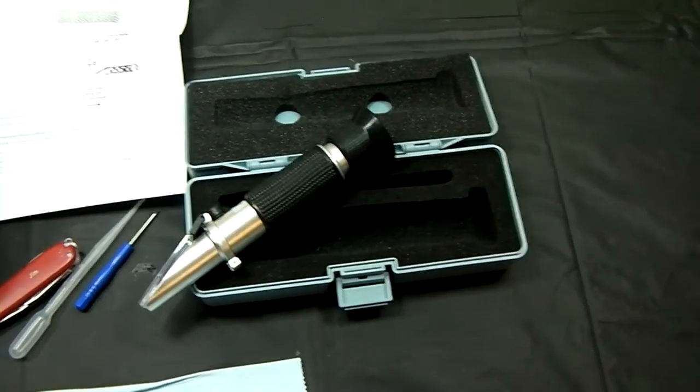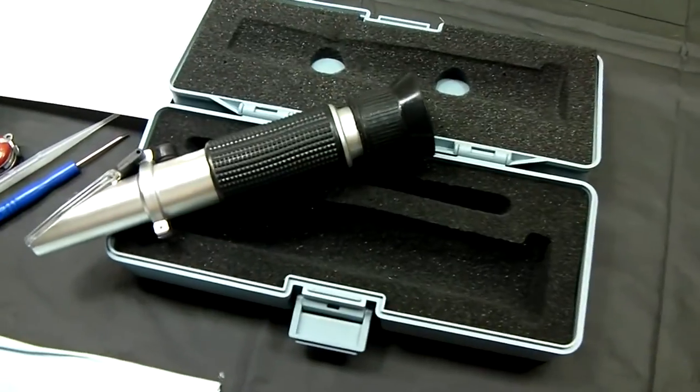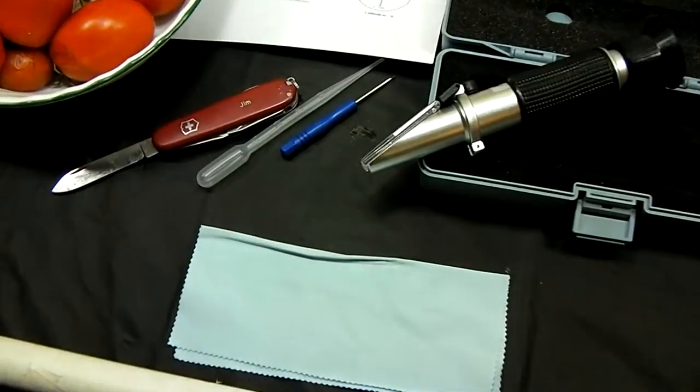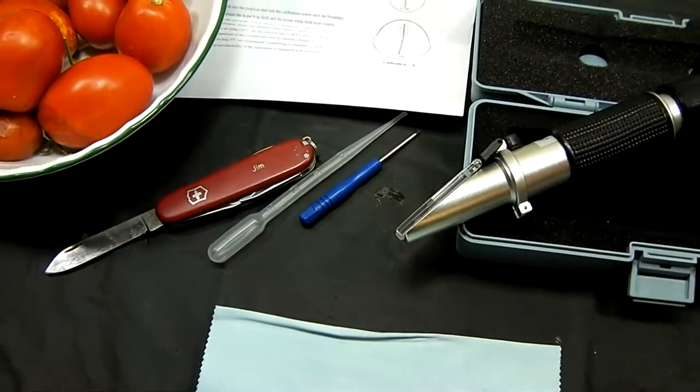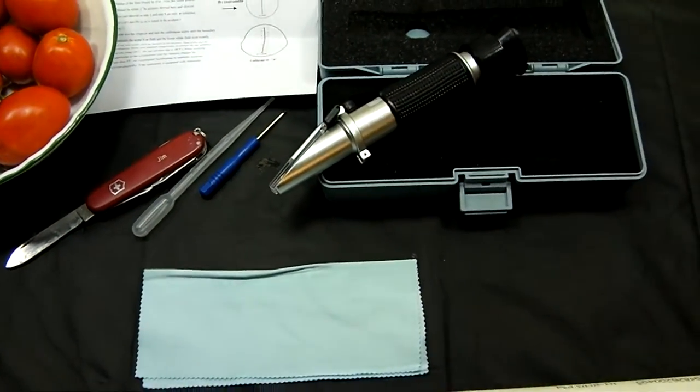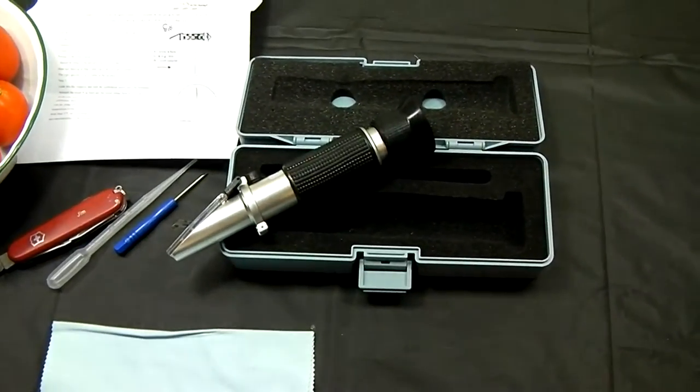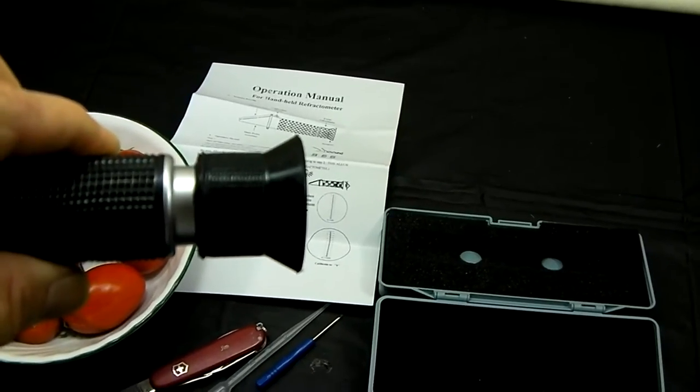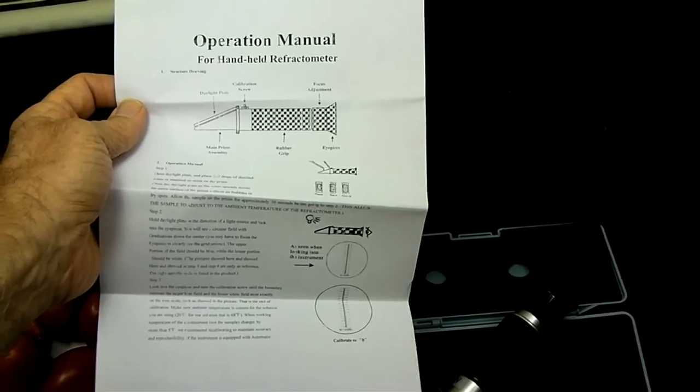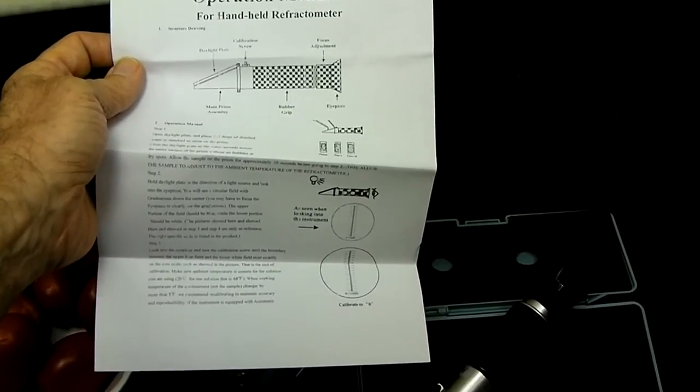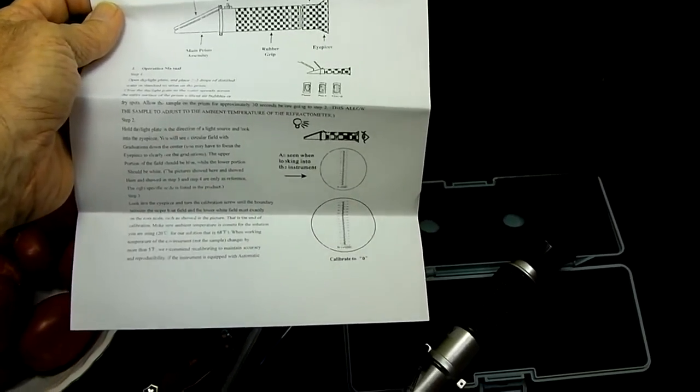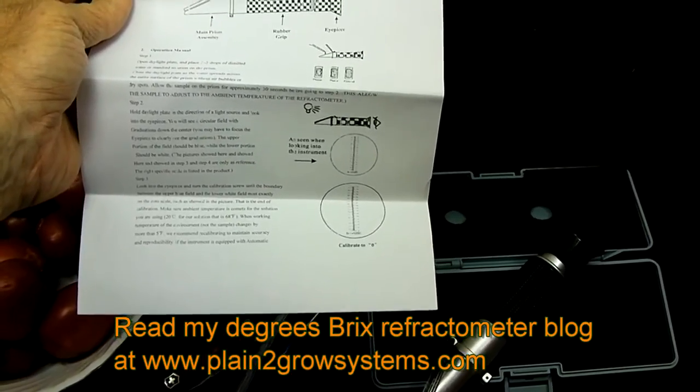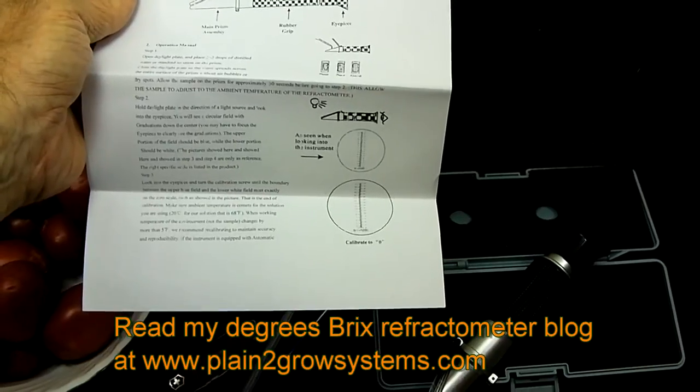You can see this kit comes with a nice little plastic box lined with foam to protect it. These are pretty tough. You don't want to be dropping them or doing anything like that. It comes with a pipette and a screwdriver. The screwdriver is to adjust the unit so you can calibrate it. This eyepiece screws in and out. You can use it to adjust the focus on the inside. It comes with a little one-page operation manual, but you're going to have to get on the internet and do some studying on percent Brix or degrees Brix.